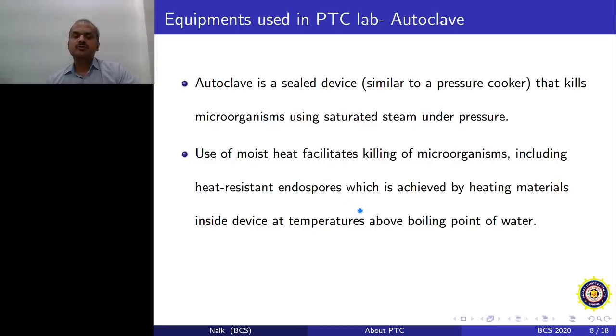But typically the autoclave temperature used for wet sterilization is 121 degrees Celsius, sometimes 125 or 130.